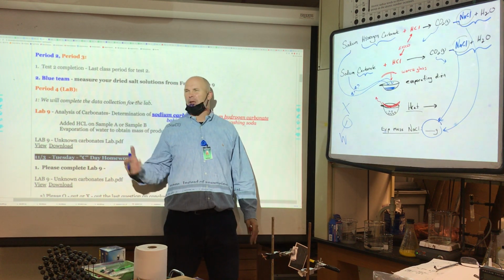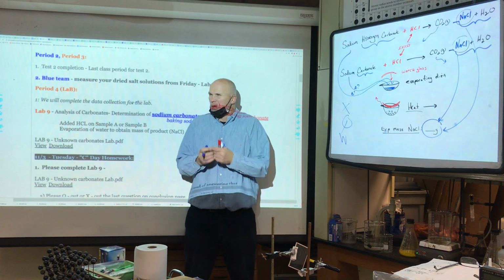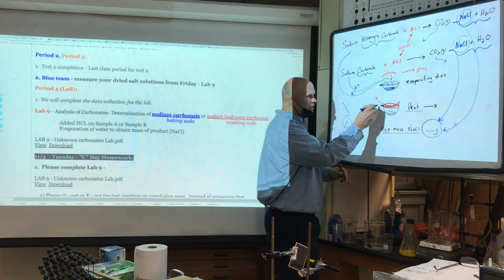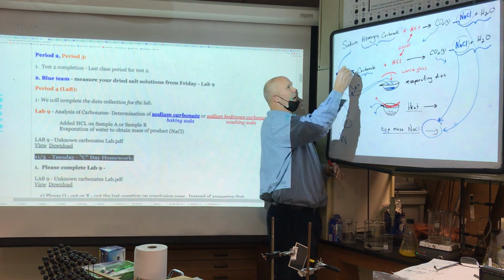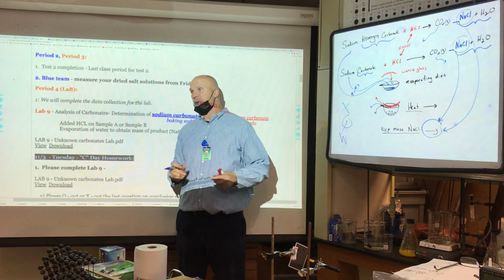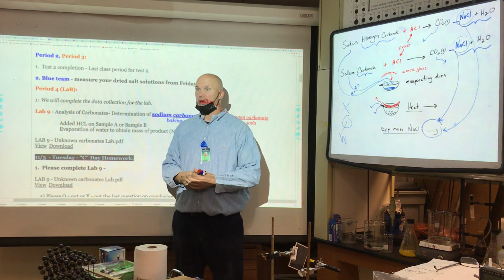Now I'm interested to see if you get under 100. I would expect you would, because we're going to lose some of that salt. There's going to be some salt that splatters out, or two, these guys weren't 100% pure. Okay? That's the lab. It's pretty simple. You guys can finish it in class and hand it in today. Make sure you have units.